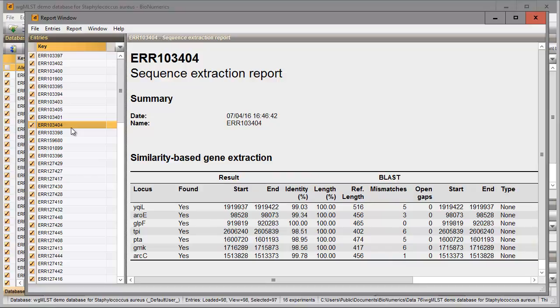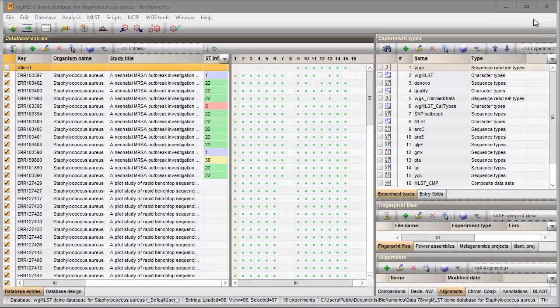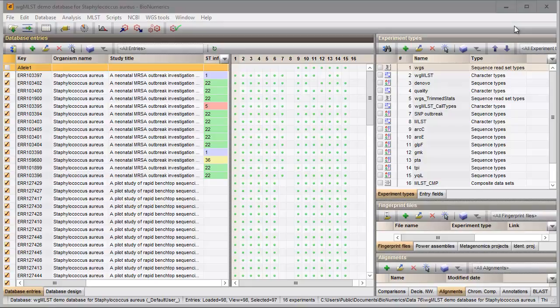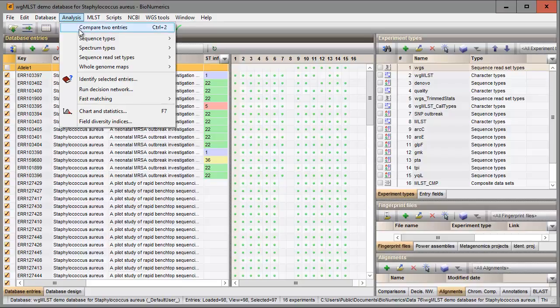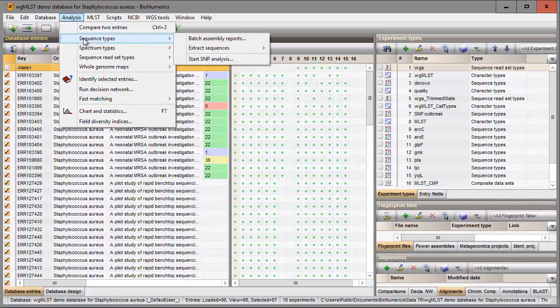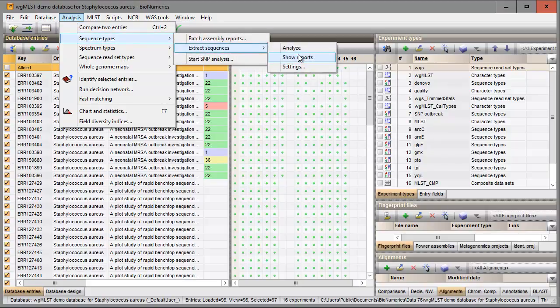I can close the report window and I can call it back at any time with the menu option analysis, sequence types, extract sequences, show reports.